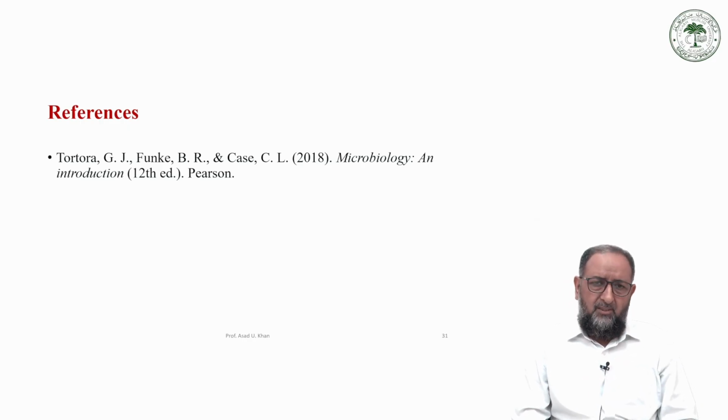Now, at the end of this lecture, I would like to give you some message. We discussed various methods. We discussed the direct method, the indirect method, the microscopic method which comes under the direct methods, and the methods required for calculating the viable count, that is the spread plate method. Then we have the membrane method. Now, comparing all these methods, you may have a confusion: why have so many methods been introduced, what is the use of so many methods, which method should be opted, and what is the best method for us to opt.